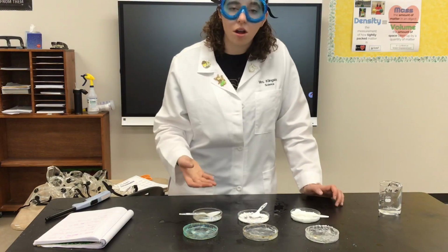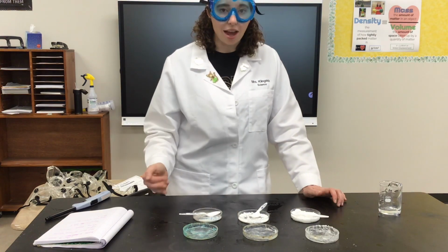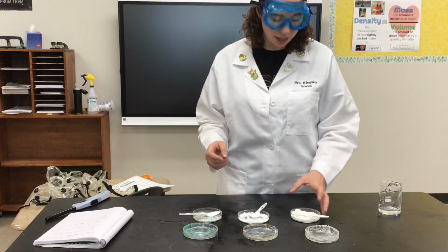Now, ethyl alcohol has the chemical property of being flammable. So this material will light on fire. What we're going to do is light the ethyl alcohol on fire, and we're going to be adding in some materials to see if there's a chemical change.